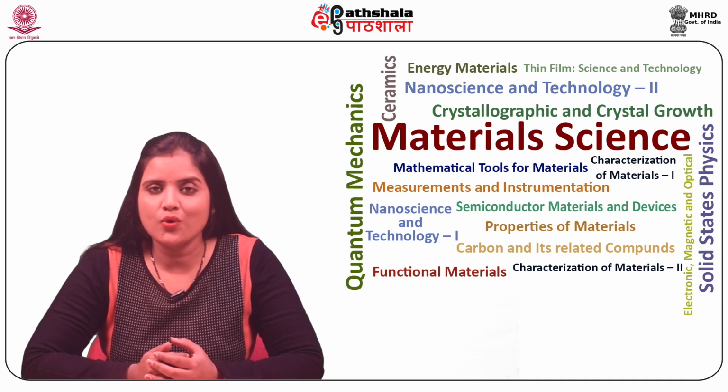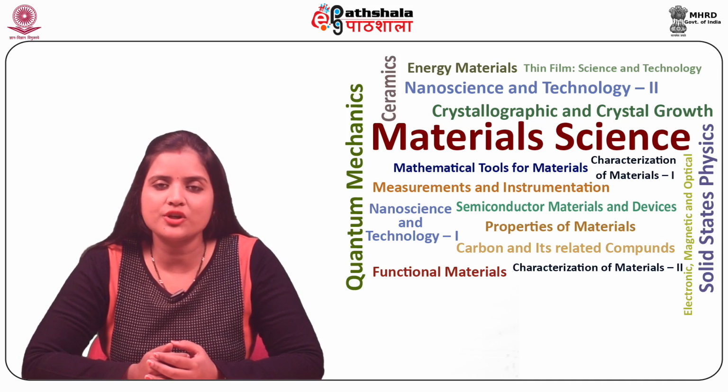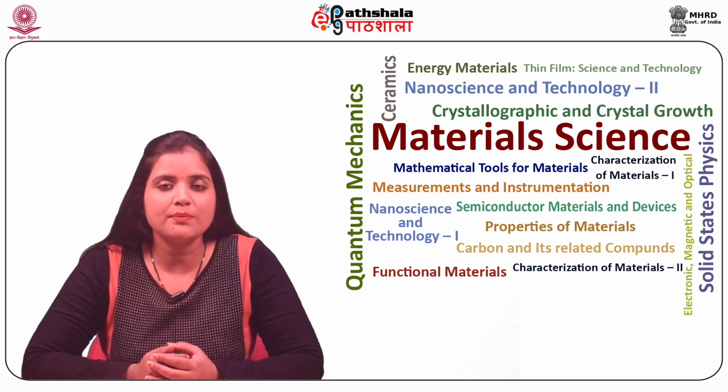Today we are going to talk on the module: oil immersion objectives, quantitative metallography, image analyzer under Characterization of Materials.